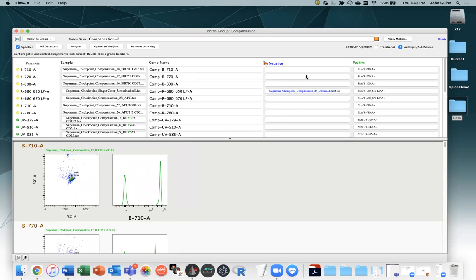And because we can do linear regression on an unstained panel, we can actually subtract out autofluorescence. So again, that will work much better if you have used cells for the rest of these single stain controls, so that you're actually dealing with consistent expression of autofluorescence. But doing something like that on a cell-based compensation approach will then remove autofluorescence via linear regression, and so that's a nice way to go.